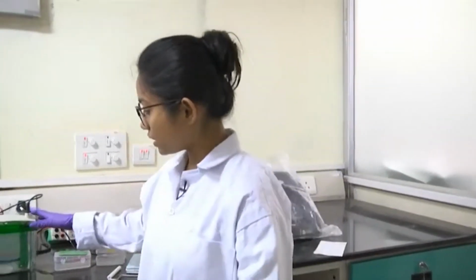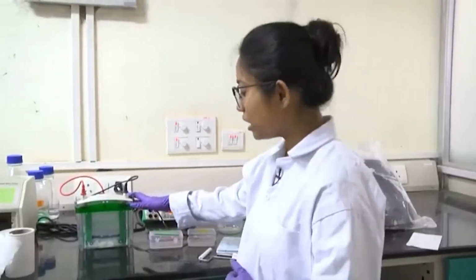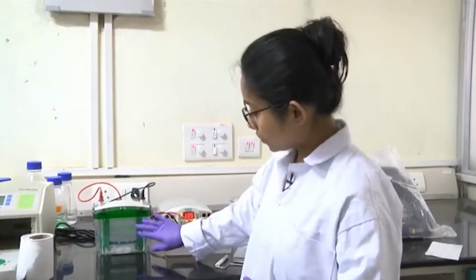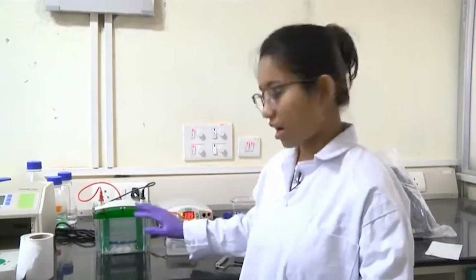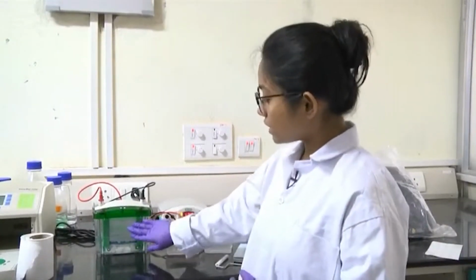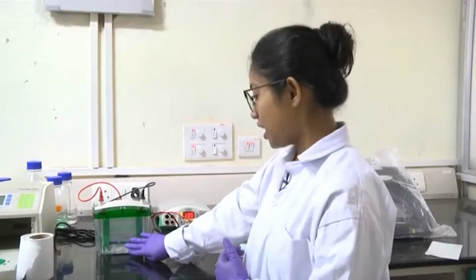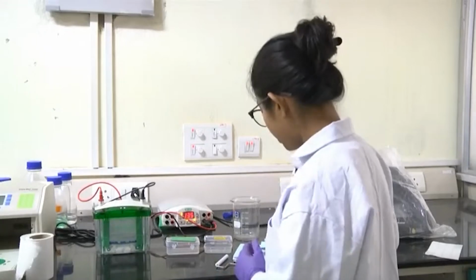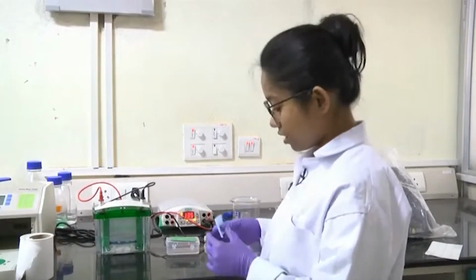So to begin with, here I have already started the SDS-PAGE gel. I have loaded my sample, it is a normal 15% SDS-PAGE, along with a pre-stained marker. So now I can see the marker and how far it has gone, and depending on the pre-stained marker, I can stop the gel when I want to. Before I stop that, as I mentioned, there is a membrane to blot.